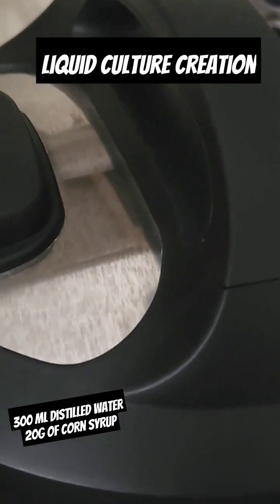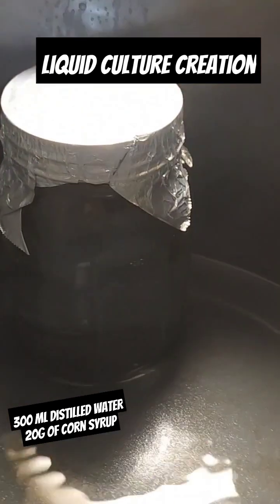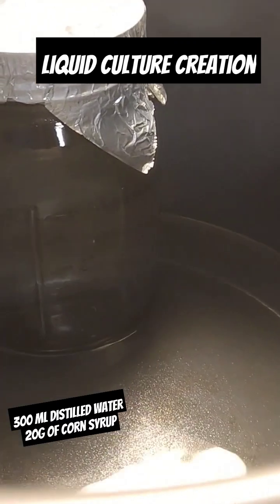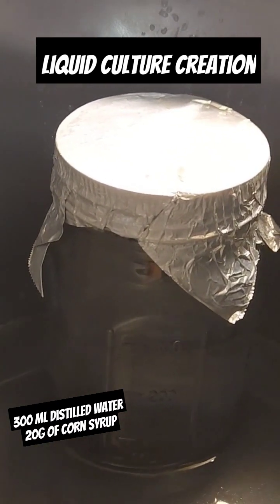I can start my 10-minute timer and let that steam build inside of the instant pot — it's going to be very warm. And we have obtained our liquid culture.